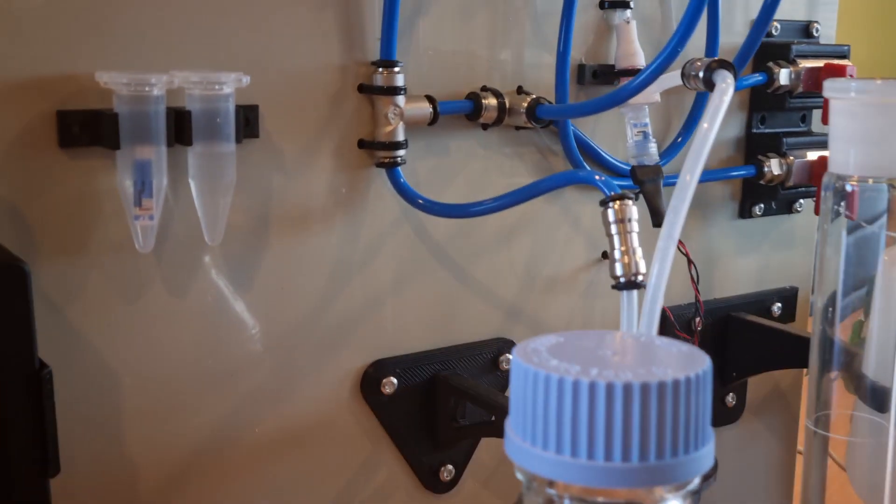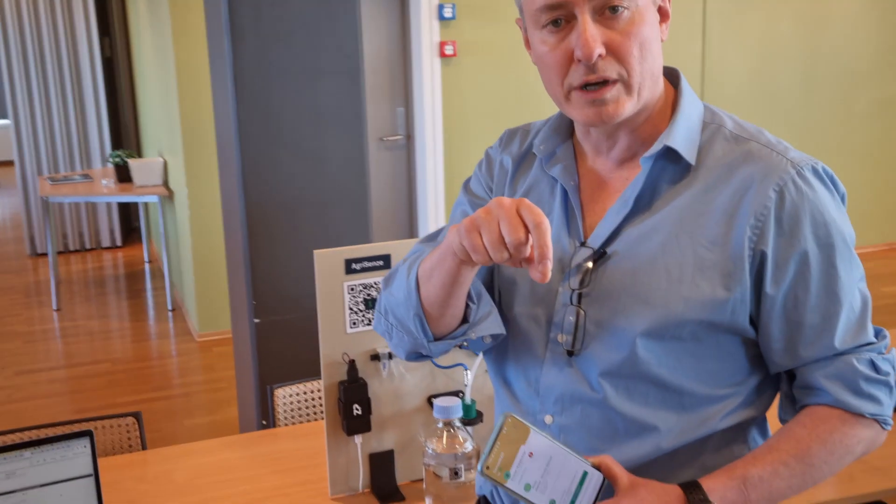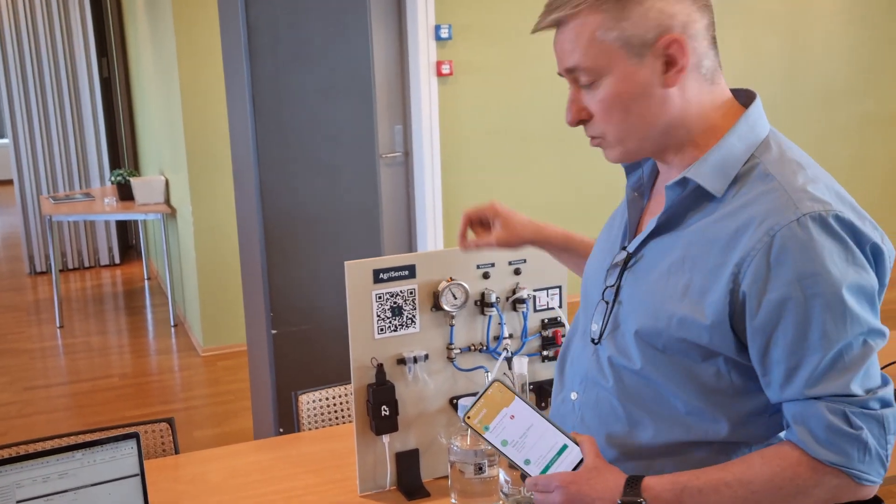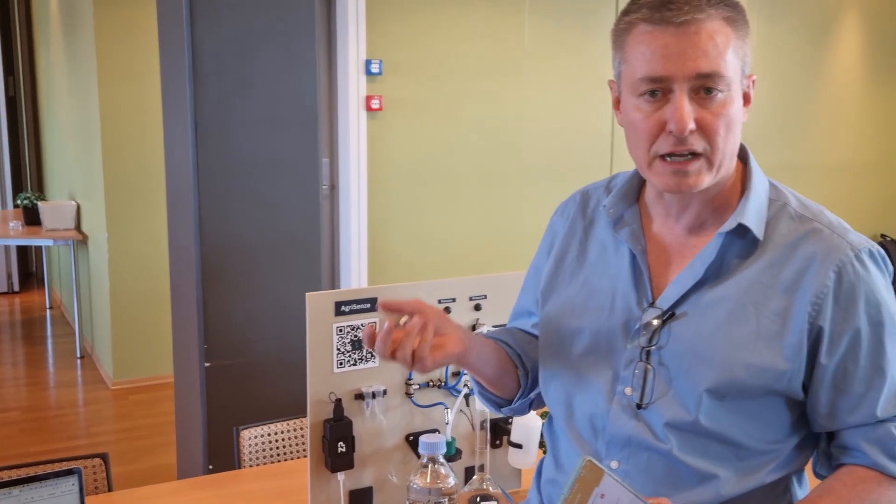So what this little setup shows you is we have a sensor, we're able to pull from a liquid reservoir, go over the sensor and go to waste, and we have a couple of pumps that are able to provide vacuum and pressure.